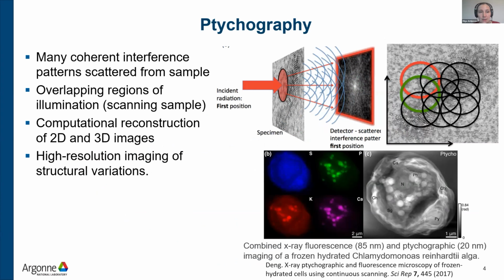In addition, some of the beamlines offer ptychography, quite often in combination with X-ray fluorescence. Ptychography offers high resolution imaging when combined with X-ray fluorescence and is used to visualize structural variations of the sample.